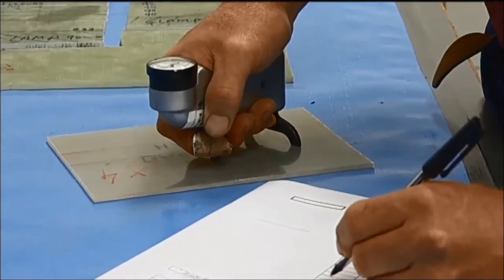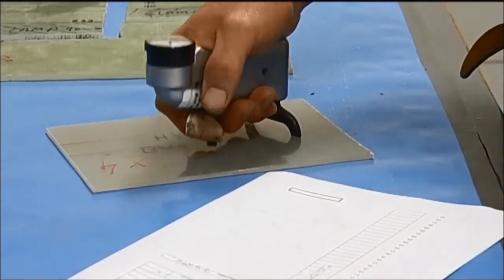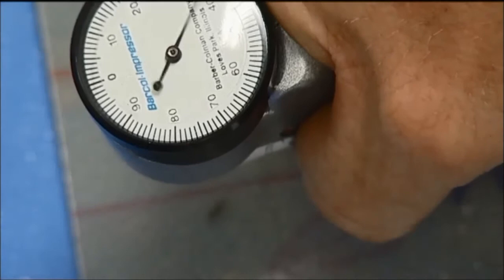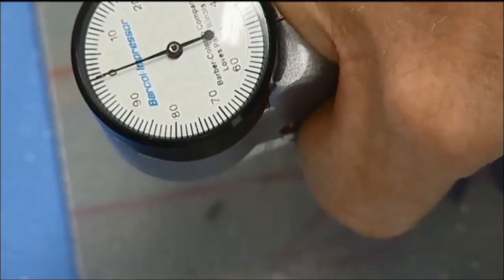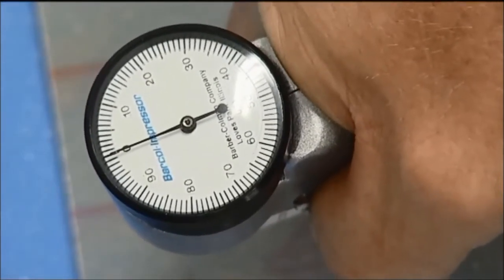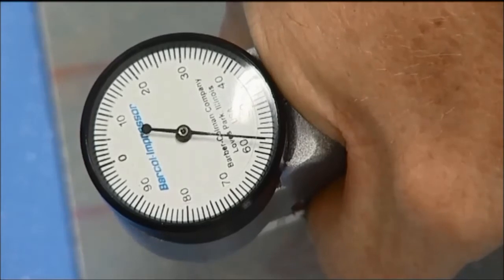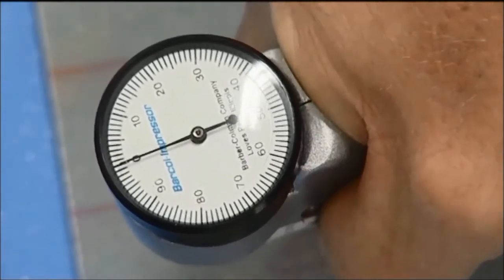The specimens are required to be a minimum thickness of one-sixteenth of an inch. They are placed under the indenter of the Barcol Hardness Tester and a uniform pressure is applied to the specimen until the dial indication reaches a maximum.